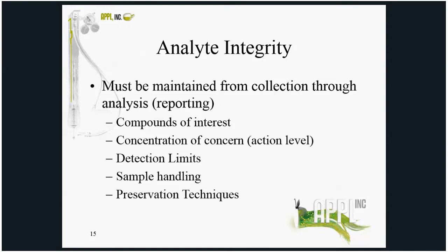Will drying be a concern? Will preservation be needed? And if so, what type? Will the samples need to be cooled, or can they be at room temperature? All of this needs to be addressed.